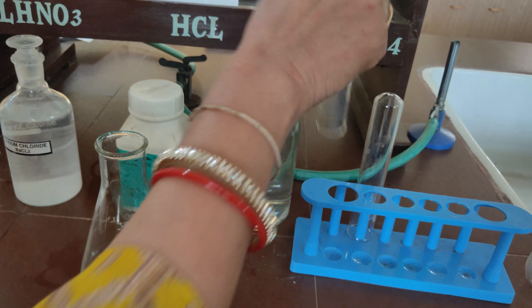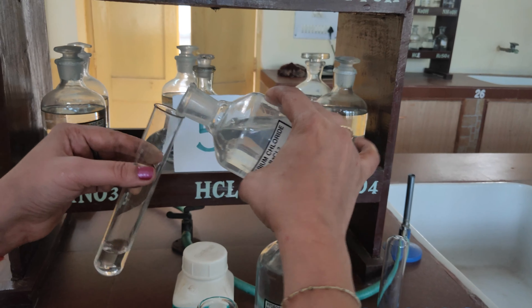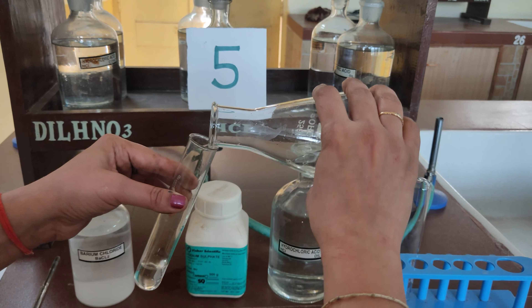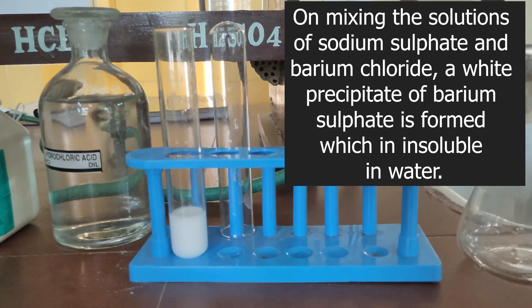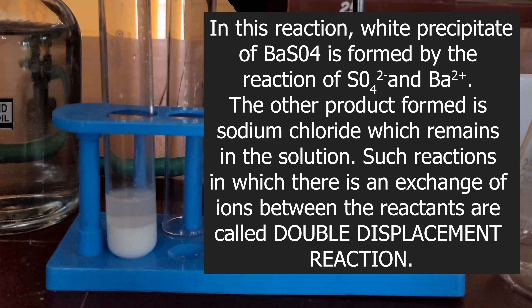Procedure: Take a small quantity of barium chloride in a test tube. To this, add a small quantity of sodium sulphate solution. On mixing the solutions, a white precipitate of barium sulphate is formed, which is insoluble in water. Let the precipitate settle down by leaving the test tube for around 15 minutes. The precipitate of barium sulphate settles down; barium and sulphate ions react together to form barium sulphate, and the other product, sodium chloride, remains in the solution. Such reactions in which there is an exchange of ions between the reactants are called double displacement reactions.